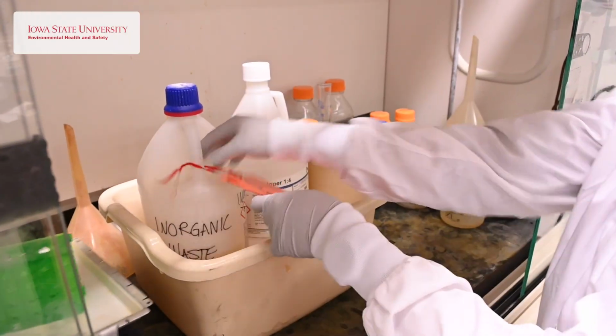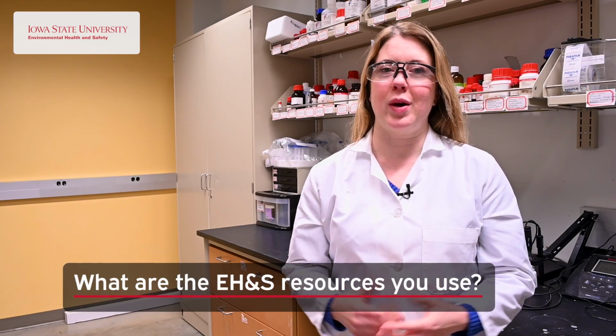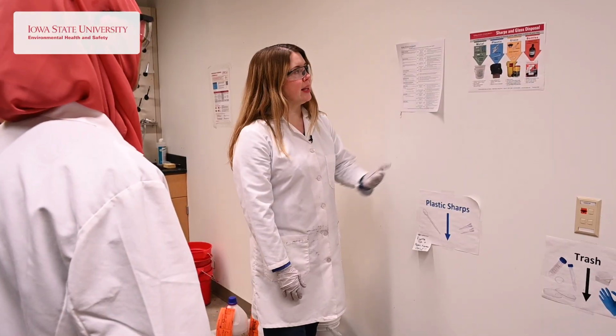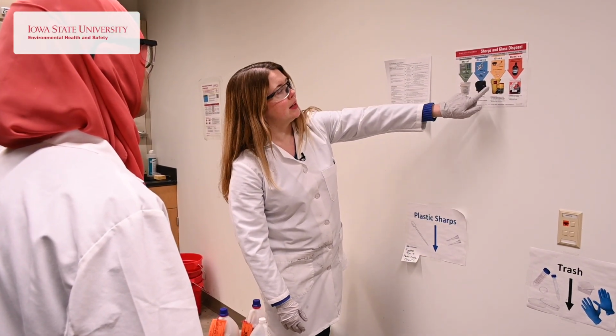EH&S offers a lot of resources that help students as well as lab managers and advisors to get oriented when it comes to waste. One of the most useful things for me has been the online training, which I think EH&S has put a lot of work into making engaging. There are also posters that are a quick reference point for students to be able to check the different waste classes and make sure that they're handling them appropriately on a day-to-day basis.